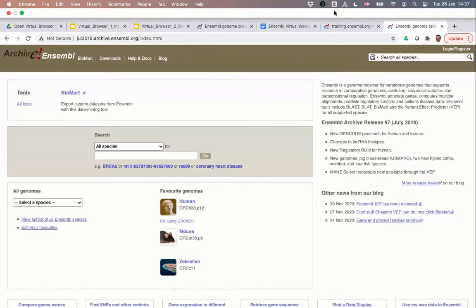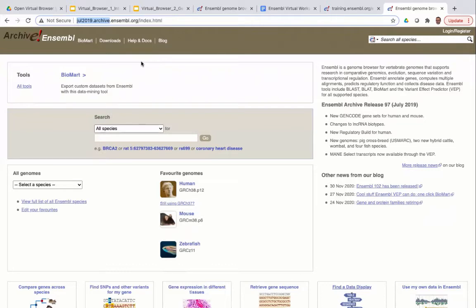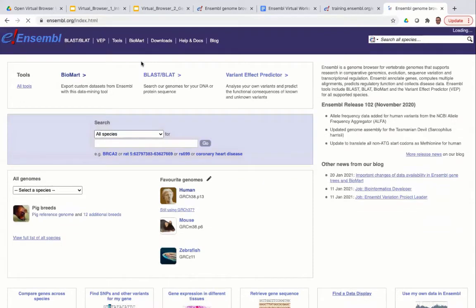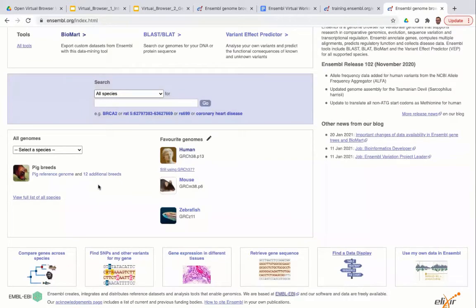Going back to the demo — in the archive, you can see the URL itself has changed. Instead of www, we now have july2019.archive.ensembl.org. To go back to the main Ensembl browser, you can just type www back in as the URL prefix. If you want to find out more information about the species available, you can go to the section on the main homepage or click the link that says 'view full list of all species'.